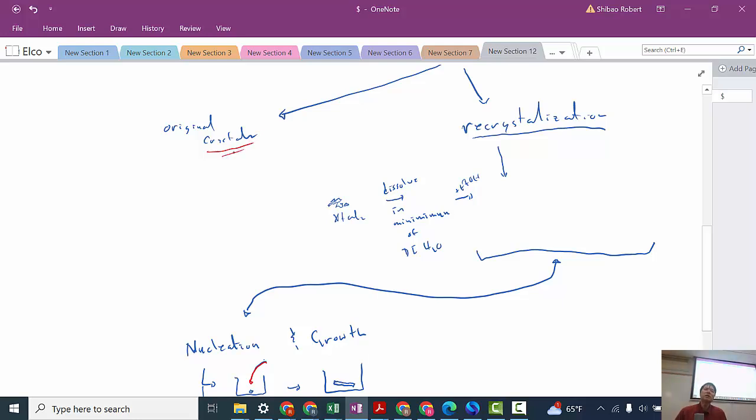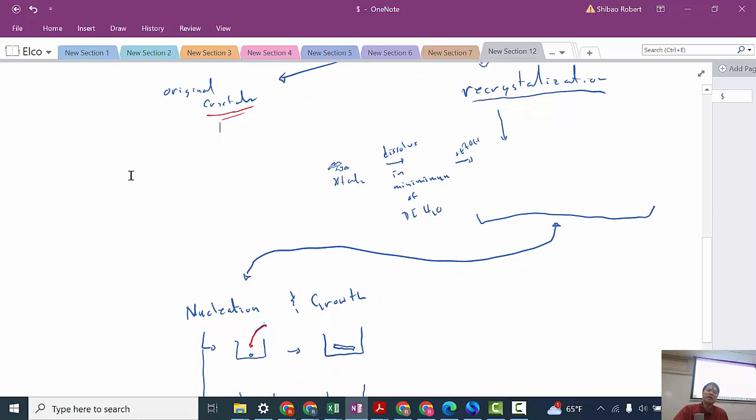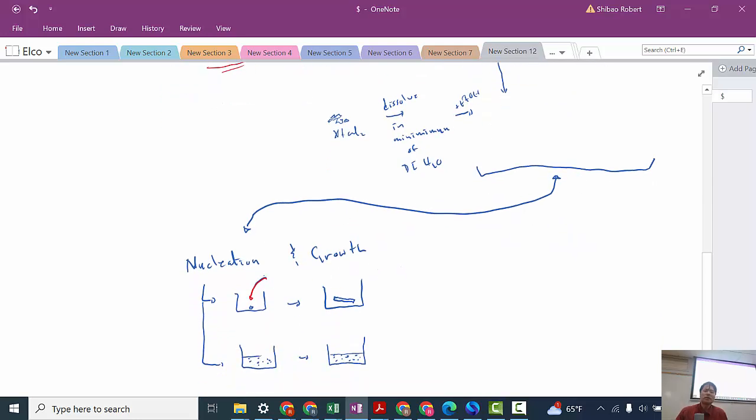A seed provides a template for new crystals to grow, because if the template's already there, an anion wants a cation next to it so the cation can attach. And a cation wants an anion next to it, and that can attach. And so we're going to try using a seed crystal here. And hopefully that ends up in growing a big crystal.